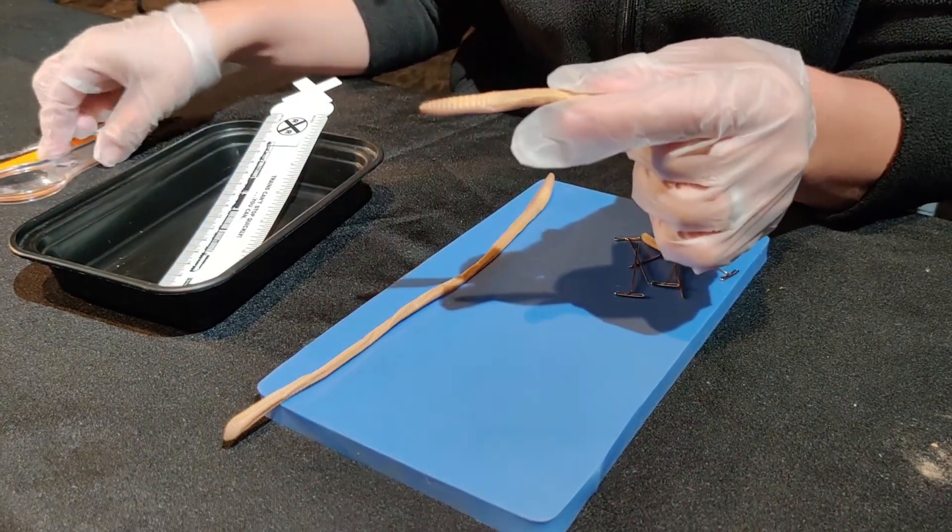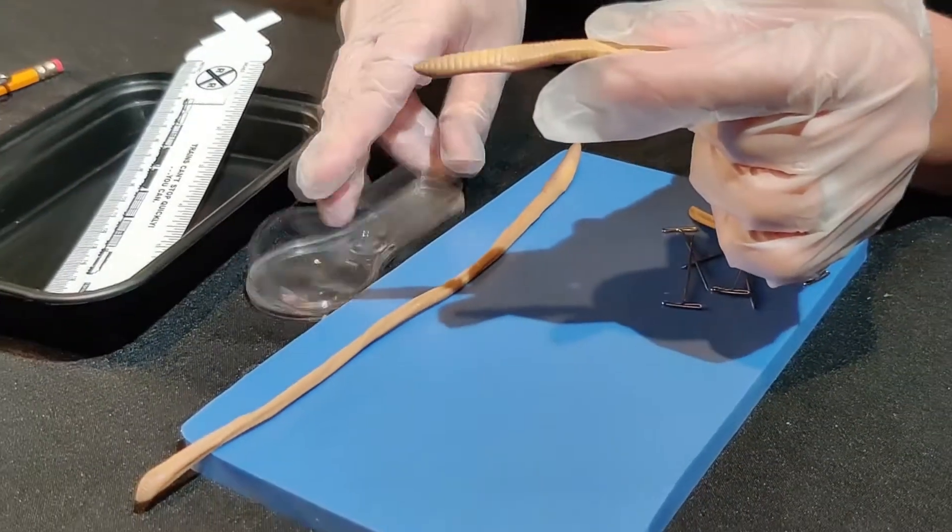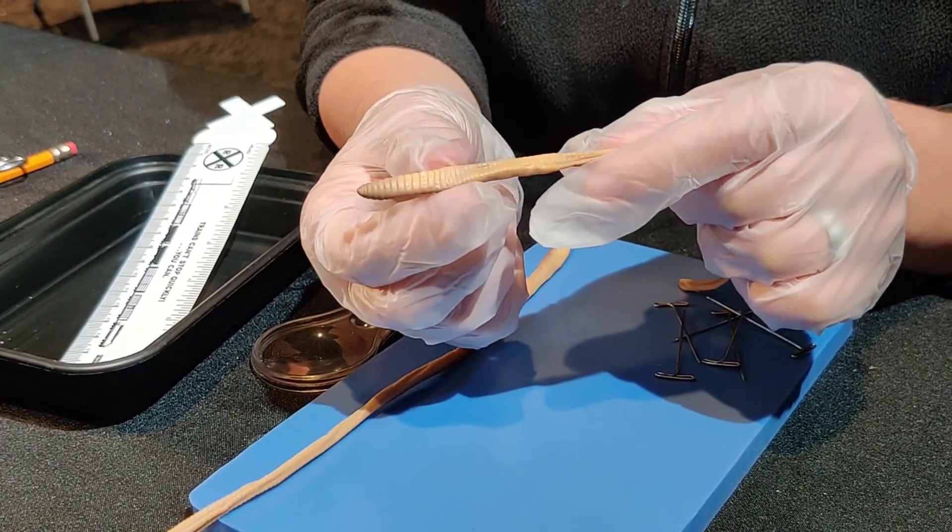This is where you would want your students to go ahead and use their magnifying glass to see if they can identify the setae. Those little hairs help push the earthworm through the dirt.